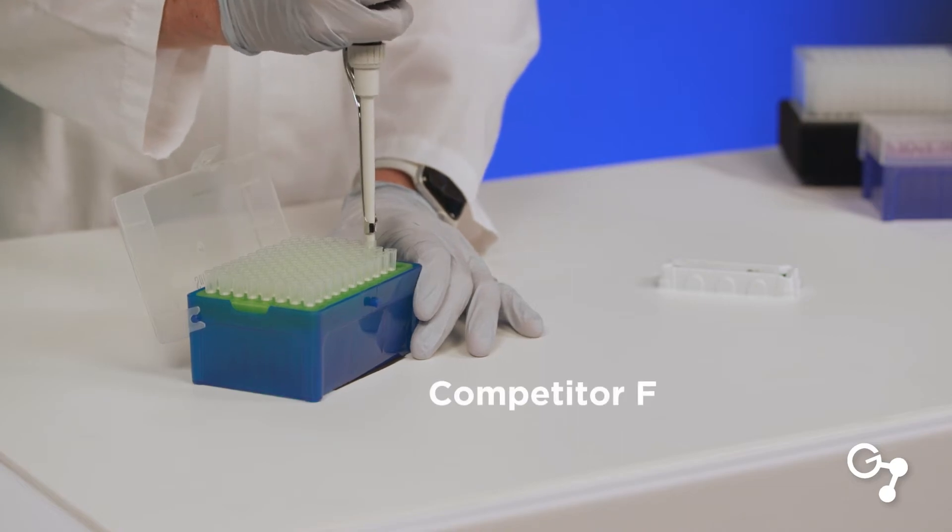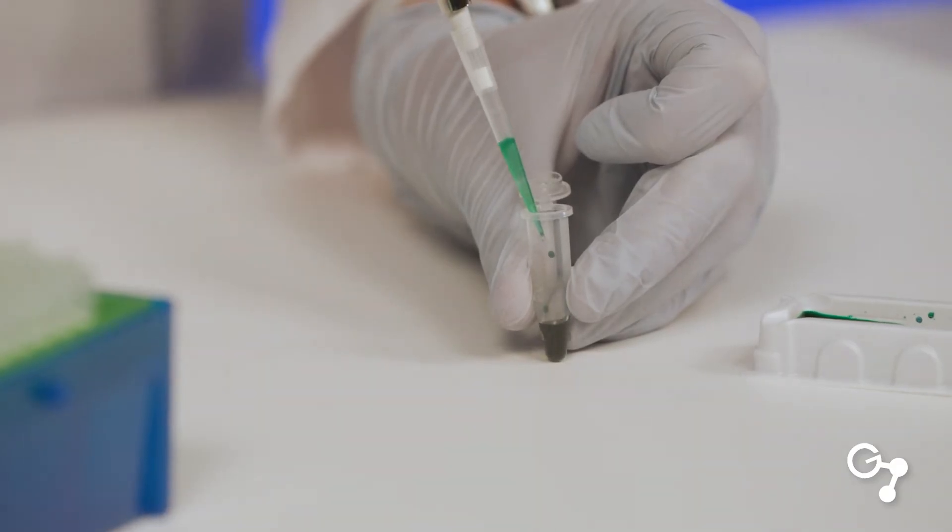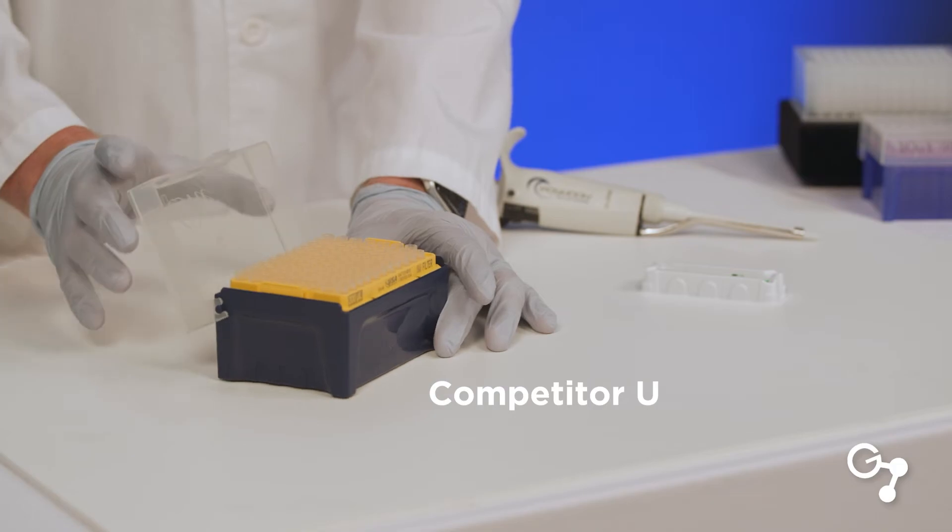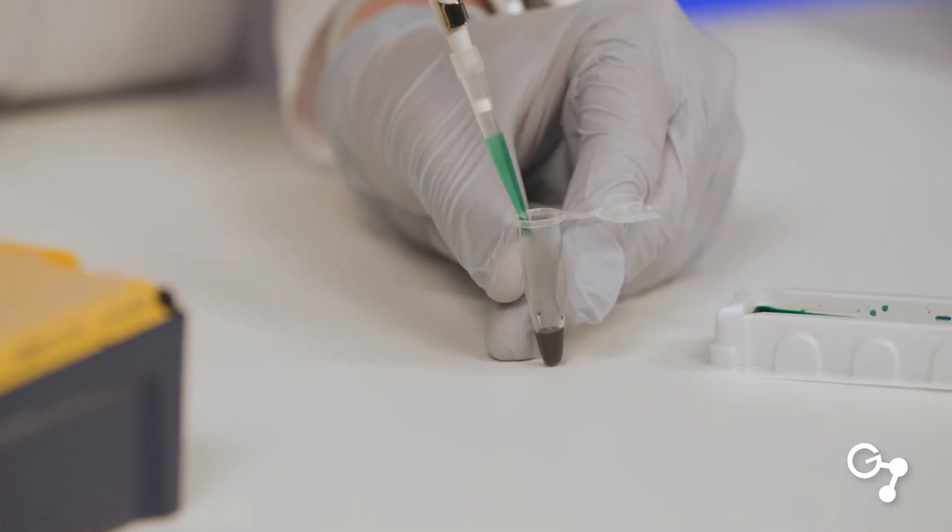And unlike Genesee's tips, competing brands lack low-binding surface technology, a self-sealing barrier, and a universal fit.